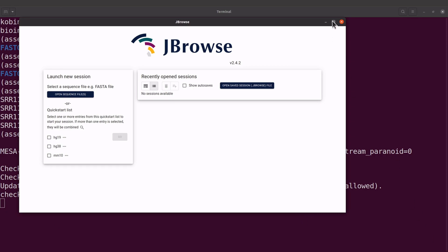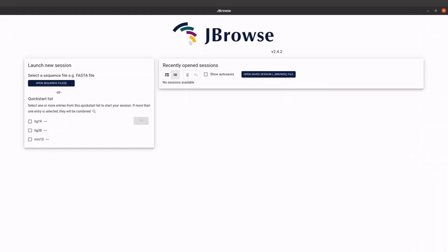Let's enlarge it. Now what we are going to do is to load our files — we are going to load the FNA file and then the GFF file. Both files were generated by Prokka. To load files or to open sequence files, come to the left side here and you'll see this button 'Open Sequence File', so click it.